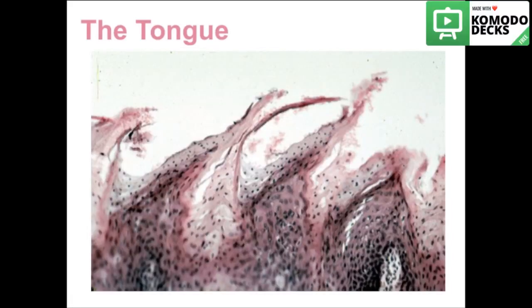Again, the thread-like filiform papillae. Filiform papillae under the microscope.